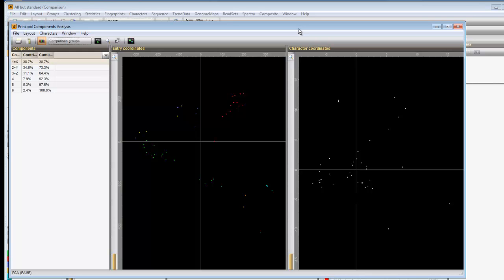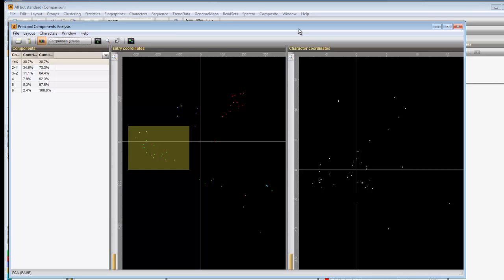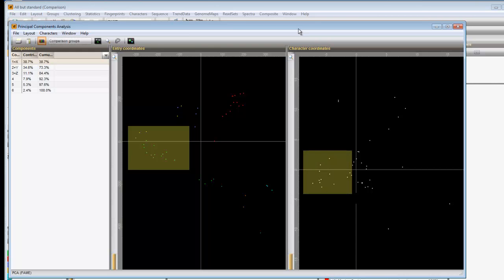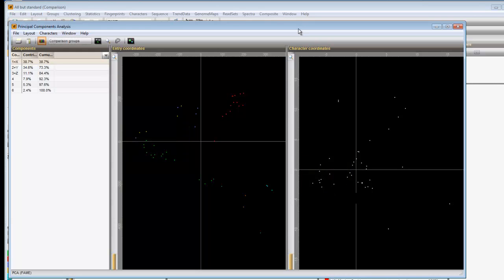For example, a group of entries appearing left along the x-axis, whereas the other entries appear right, will have higher values for the characters occurring left on the x-axis and lower values for the ones appearing on the right side, and vice versa.